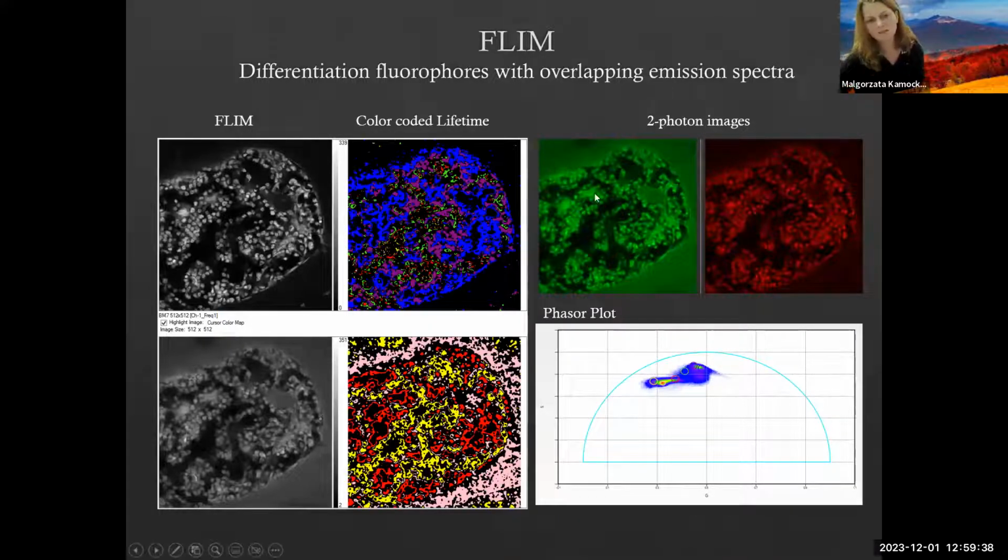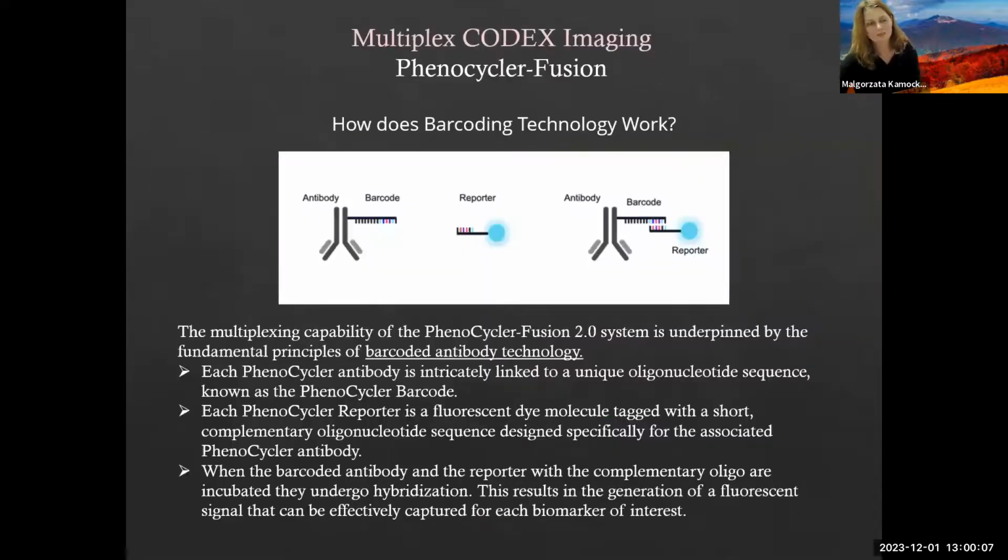You can see that it looks pretty uniform, but we know that there is a bone marrow there having different types of cells, which we are not able to distinguish even after we apply certain staining because of high autofluorescence. But doing lifetime imaging, we can really group together pixels having the same lifetime and look how many components we have from the red channel and green channel specifically. So there is a nice technique to look at more probes that we really can image.